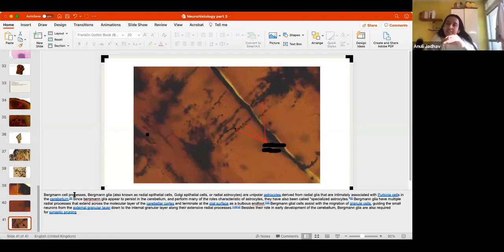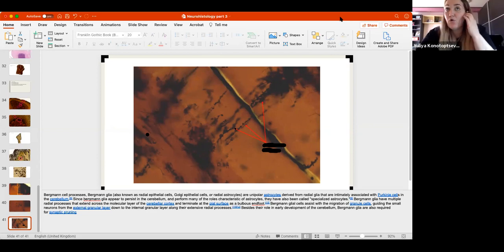Yes. But, Julia, we can't see the inferior olivary nuclei cell bodies. Inferior olivary nuclei are in the medulla oblongata, so we need a section of medulla. This is cerebellum. The same way we cannot see the pons nucleus, because it is in the pons. So all of these nuclei that we have talked about, we definitely cannot see them. We will only be able to see maybe some fibers, but we just saw climbing fibers, and even mossy fibers weren't really visible.